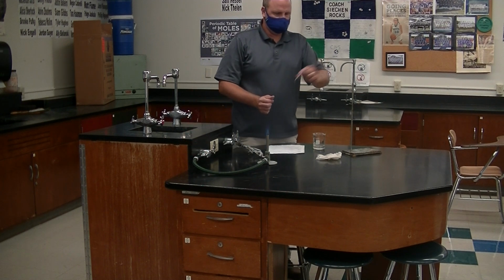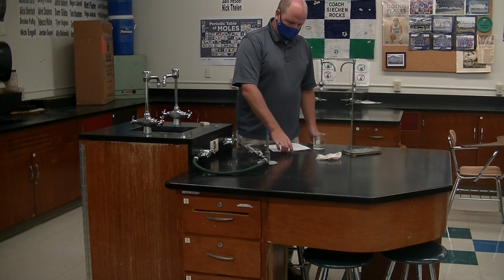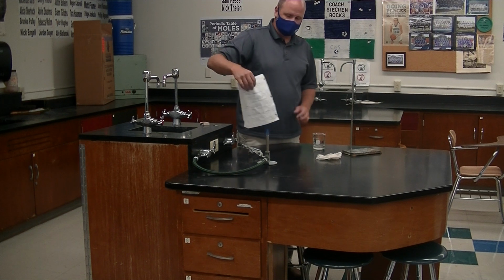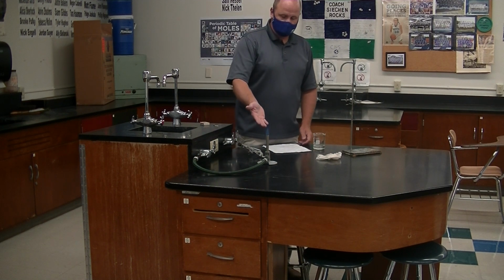There we go. Bunsen burner is lit. Can you see the blue flame? I don't want to put the paper any closer. See how it's got a blue flame? That's due to the fuel. This is methane or natural gas. So we use this to heat things.